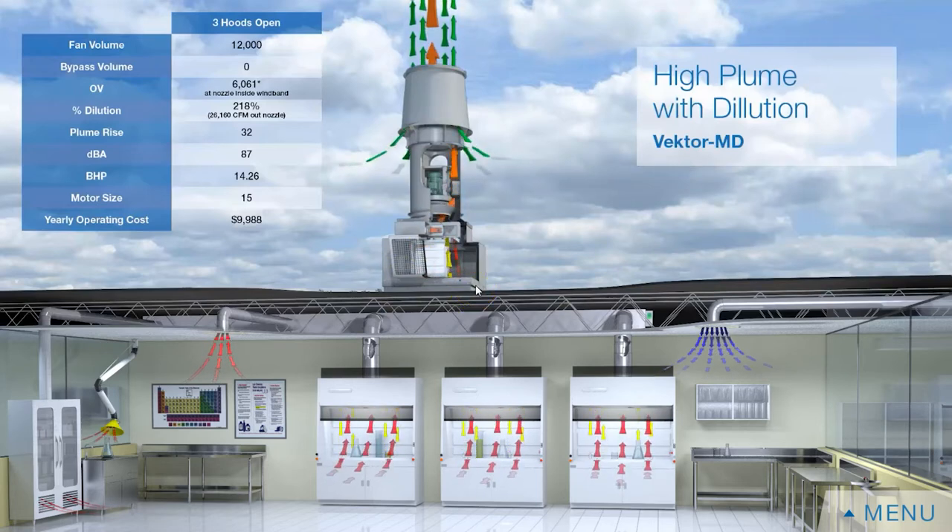The disadvantage is that service items — motors, shafts, and bearings — are all six to eight feet off the roof deck, so you have to make provisions for servicing these products and ensure there is adequate access.